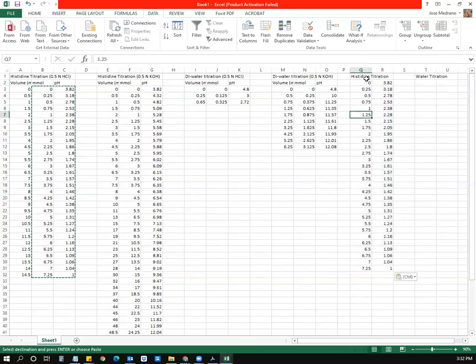Now the first column on the left here is my acid titration, the millimoles of the acid. And I said make these negative. So over on this left column, I'll say I want this equal to the negative, or just minus sign, value of this cell here.